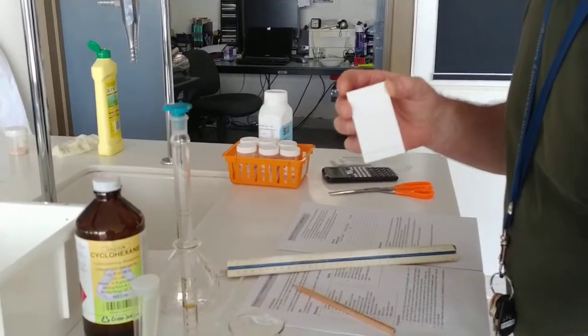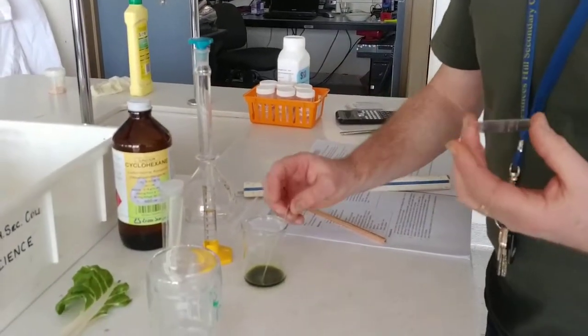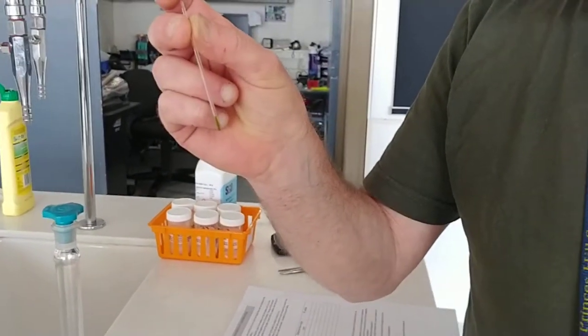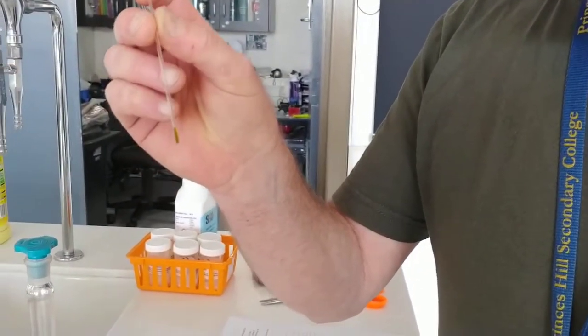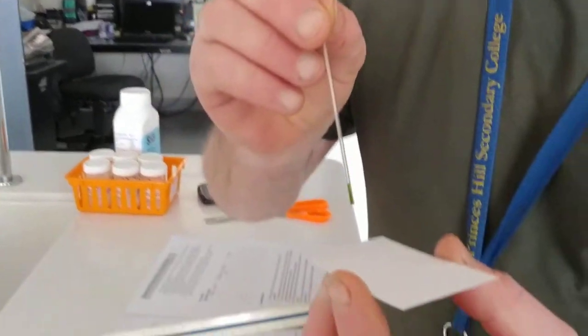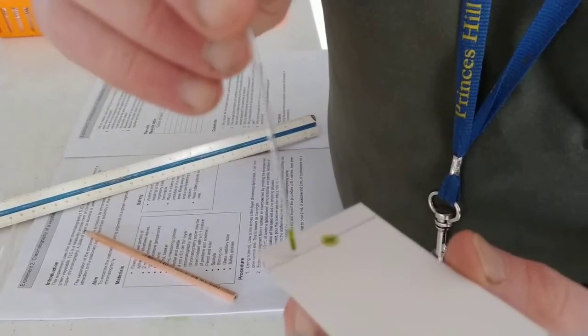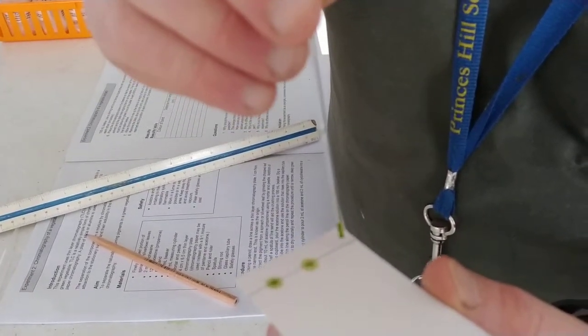So what we do now is we take our plate, and we have this thing called a capillary tube. It's just a hollow tube, and through capillary action it draws up the chlorophyll and all that sort of stuff. And then we just gently put a dot on the plate. We're going to put 3 dots. We're going to do it 3 times.